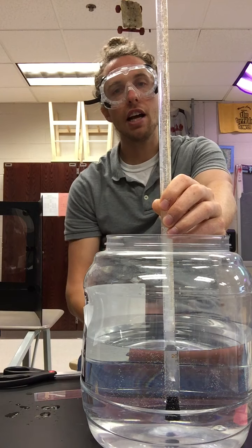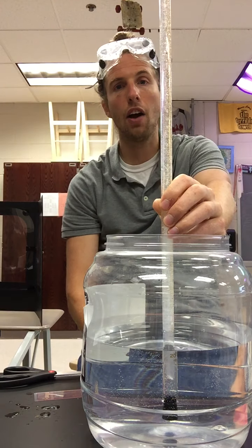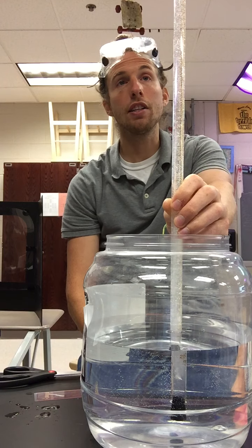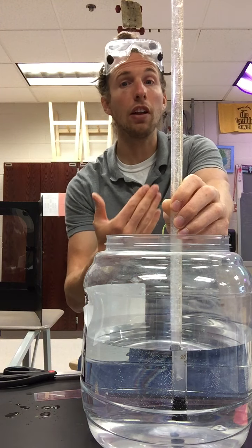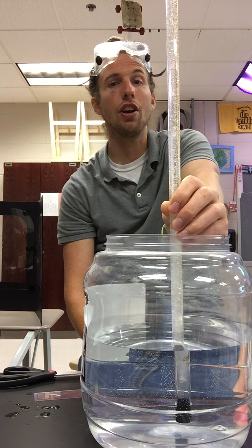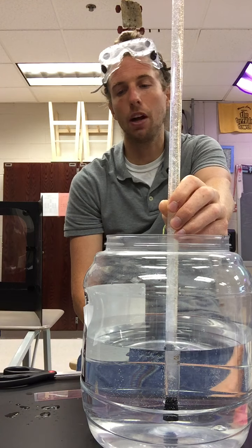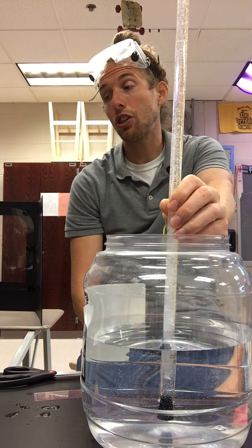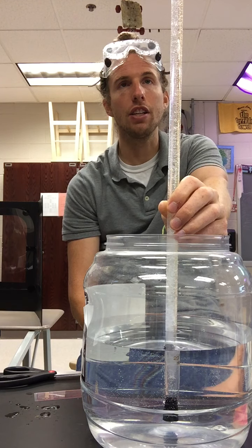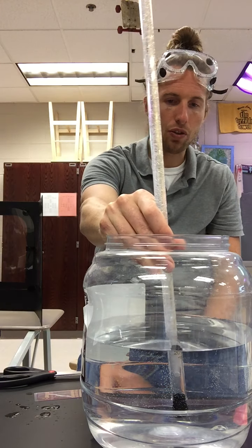And something else we didn't really discuss is the air pressure right now. So I used just the internet to figure out at a local airport what the air pressure is, because air pressure is really important for pilots to know their specific elevation or their altitude based on their equipment. Their altimeter is based on barometric pressure, so they need to know what the pressure is outside. Is it a rainy day? Is it a sunny day? That affects the barometric pressure. So today, the barometric pressure outside is 762 mmHg, 762 millimeters of mercury. And we're just going to let this thing continue to react.